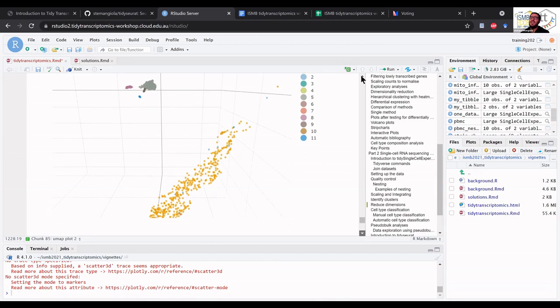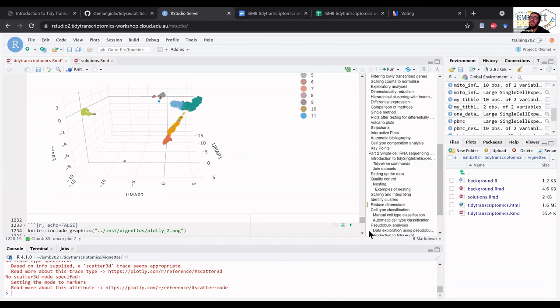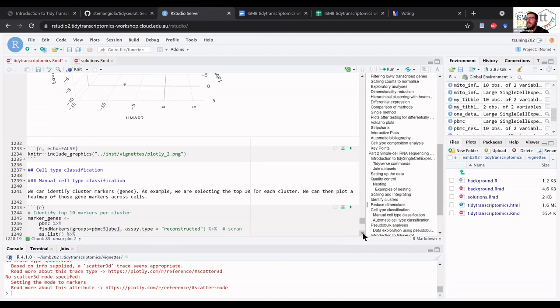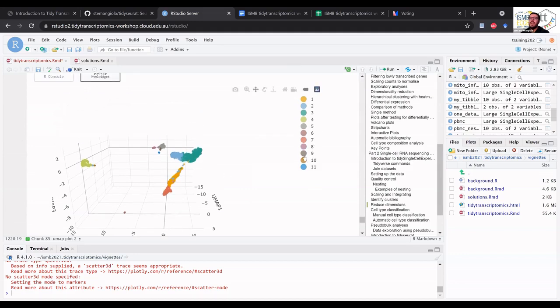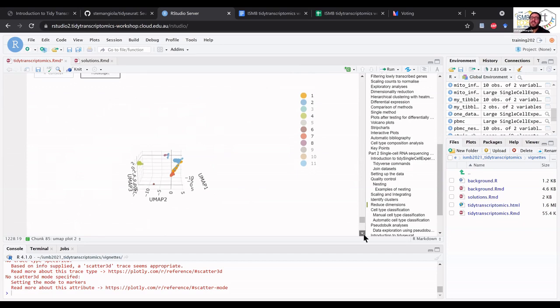It's a very cool option that is pretty easy to do actually. Yeah, exactly. You saw the question in the chat, yeah? Yeah, these are the 11 clusters. Yes, with this you can deactivate clusters if the space is too cluttered, and you can again interactively explore your heterogeneity in this way. Very cool indeed.